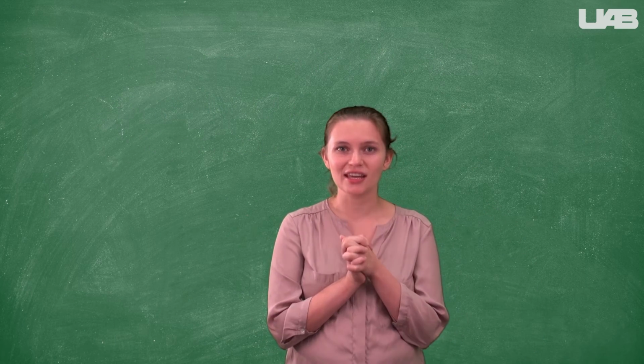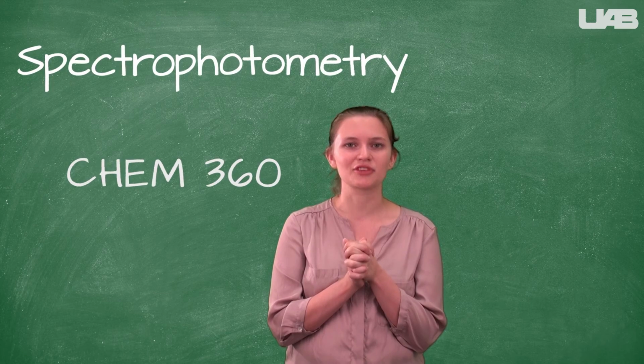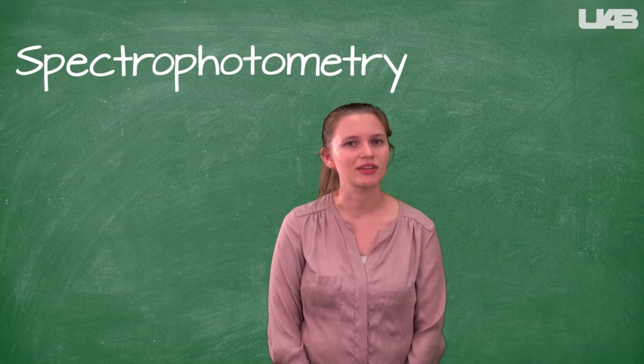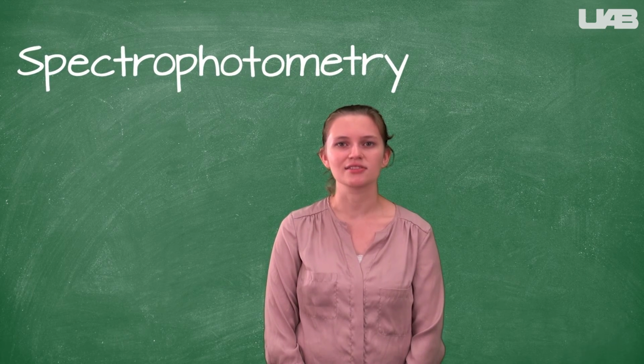Okay, so now you've made your dilutions and it's time to analyze your samples using the spectrophotometer. This is located down the hall in Chem 360. We first used the spectrophotometer in the chromatography lab, but in that lab we were considering the purity of the sample. In this lab, we will assume that the sample is pure, because we prepared it with the expectation that no side reactions occurred. Thus, the way that we use the spectrophotometer is a little different.